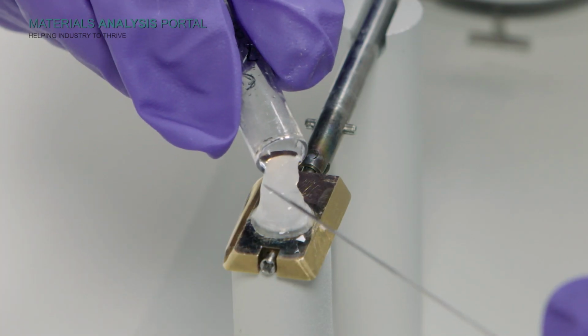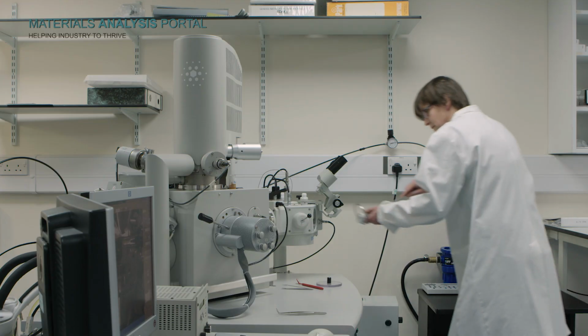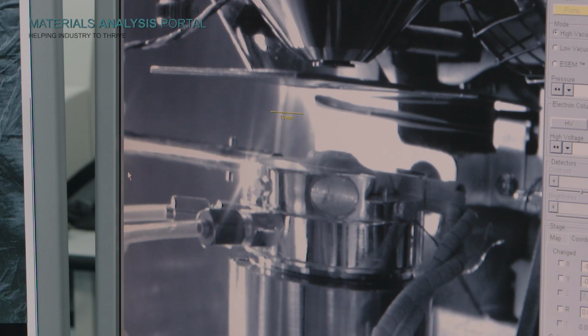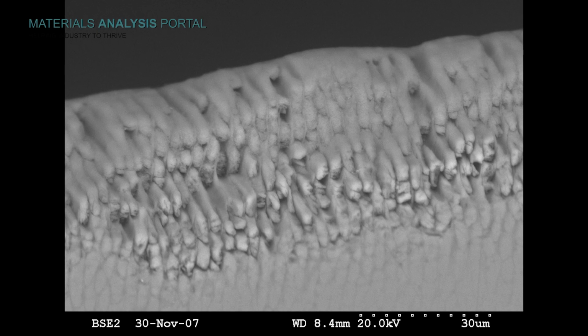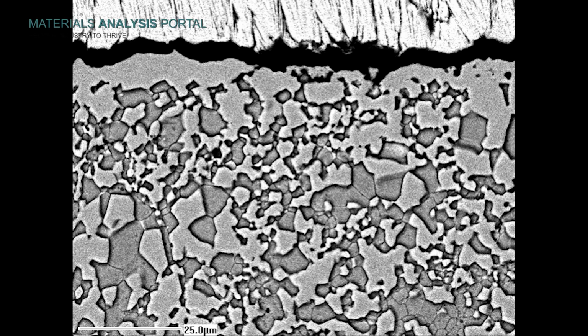We can investigate grain boundaries in complex polycrystalline materials, and even image and analyse biological tissues, DNA, pharmaceutical liquids, gels, or proteins. Our samples include pigments of ancient Roman glass, tooth enamel in studies of dental caries, and metals from turbines and nuclear power stations.